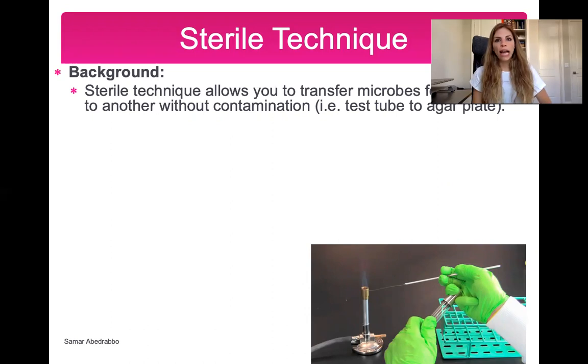Say you have bacteria in a test tube here, and I want to transfer it to an agar plate. How do I transfer it, making sure that I only get that bacteria and nothing else? And that's what sterile technique is. It's transferring microbes without any contamination.